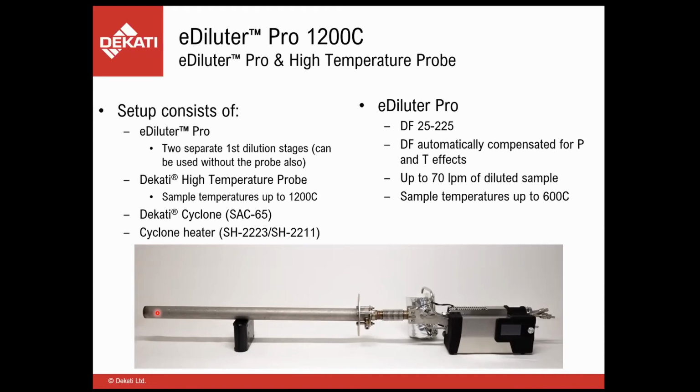The probe can stay in the high temperature zone for long periods of time. It has been used for weeks of measurements continuously without any issues. So it can be used for long-term measurements. The most typical use would be to do sort of optimization. So it's not typically used continuously, but to try to optimize, for example, the use of additives, or how, for example, coal is added into combustion of biomass, because it can really help reduce the formation of the corrosive species.